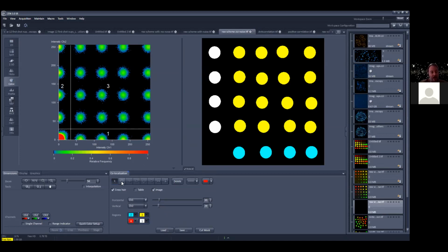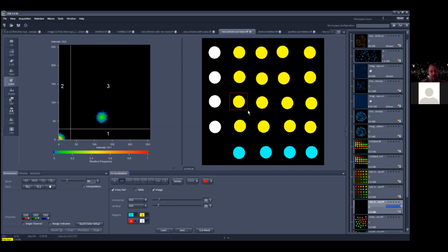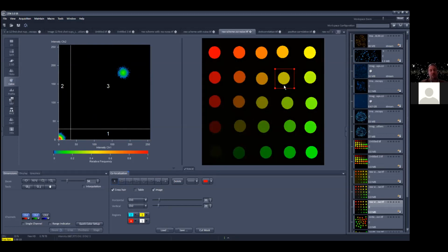So there is, however, another type of analysis that can be done. I could, for example, select here a square and select on the image this particular object and infer from there what is the distribution of red and green in this object, in that object, or in these two objects, and I can use that to ask the question: in this object with this specific color of green and red, let me remove these markings here, how green and how red is it? This one and this one and that one. And I can find that each one of these blobs exists in a different position in the scatter diagram over here. Okay, and I can draw different types of shape, and I can add and delete and make the lines thicker and change the color of those lines.